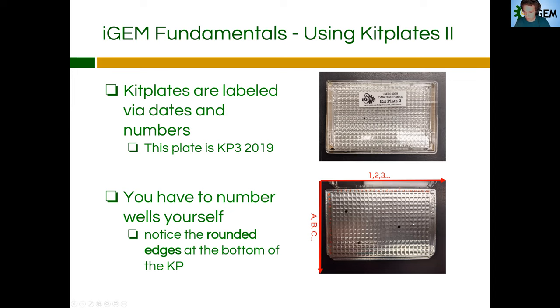Funnily enough, these kit plates actually do have labeling, but it's underneath the foil wrapping, so you can't see it. It doesn't make much sense to me because you have to do the labeling yourself. I guess if you're very careful you could remove the foil, but we just do this method instead.